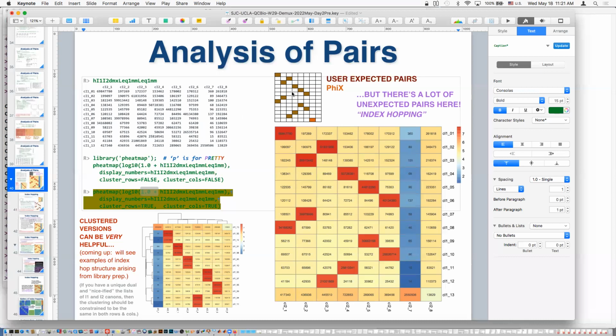Oh yeah, so if you look at the user sample sheet, it turns out this is the pattern that you should get. And it matches, right? We got these extra guys in some, but the upper left corner, that's the exact pattern. That's now the point where we check for concordance against the user sample sheet.